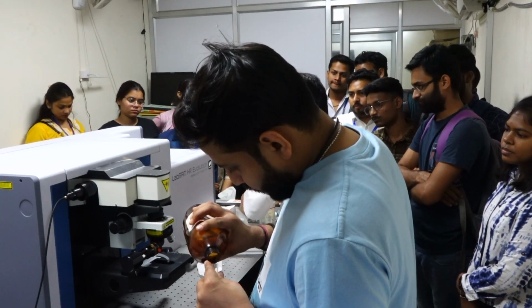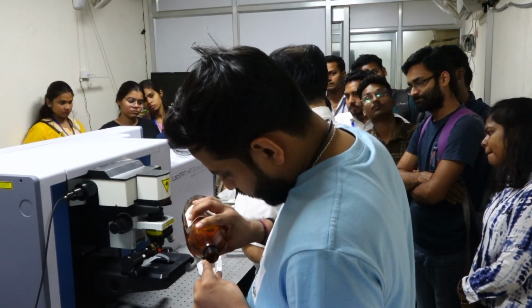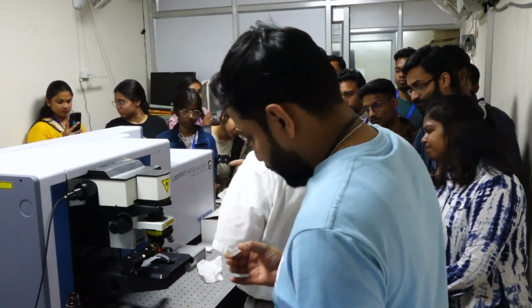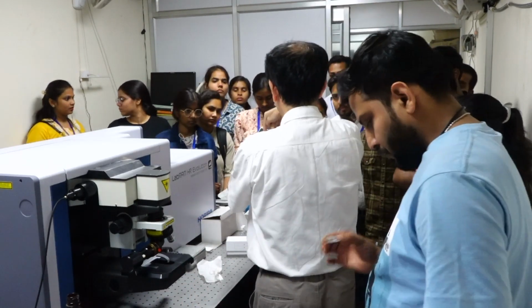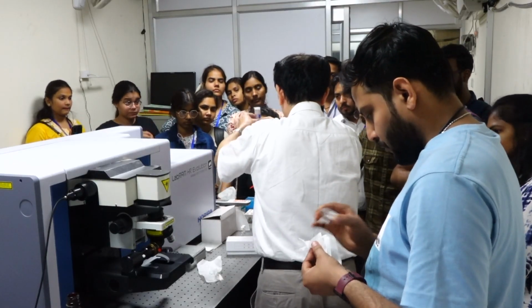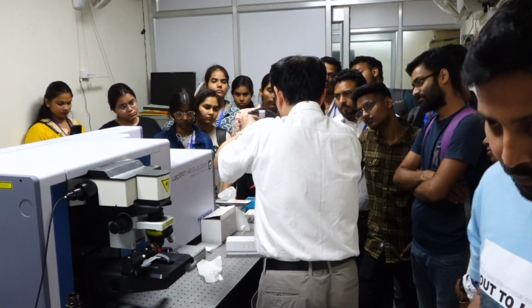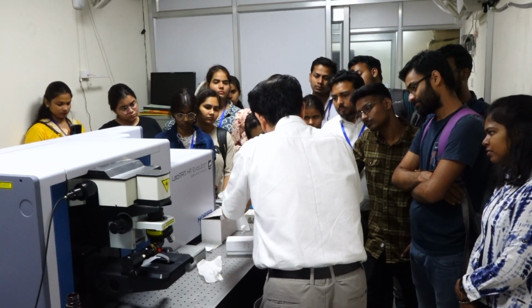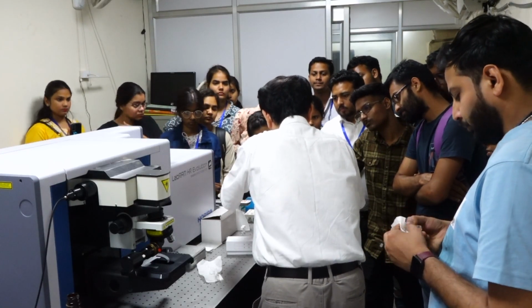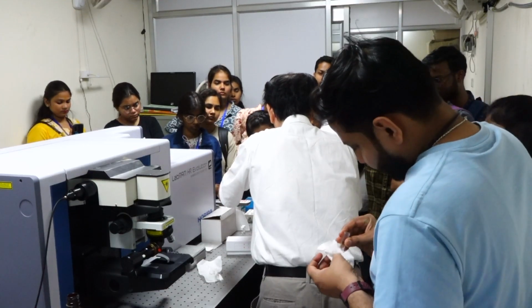How about in this case? This is a Raman microscope. So here is a microscope objective. Laser line comes from the top of the microscope objective, and this microscope objective focuses the light onto a small spot. Then the small spot irradiates the surface of the sample. Then the Raman scattering occurs from this small spot to everywhere.